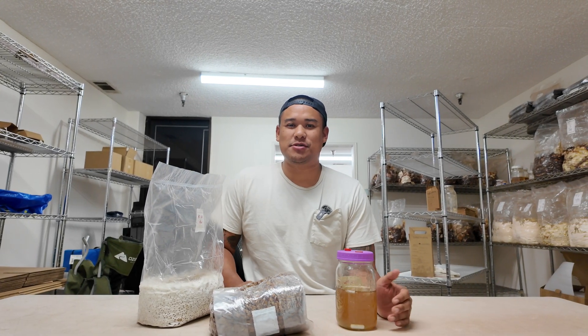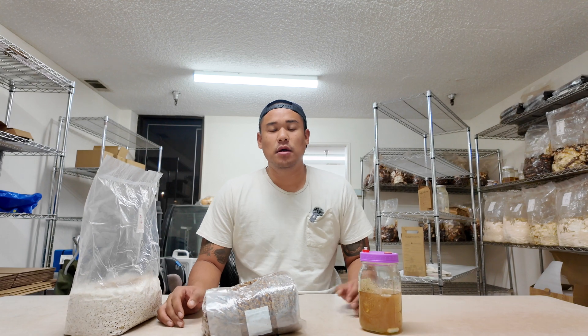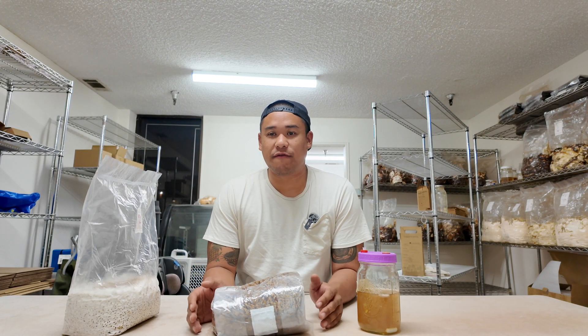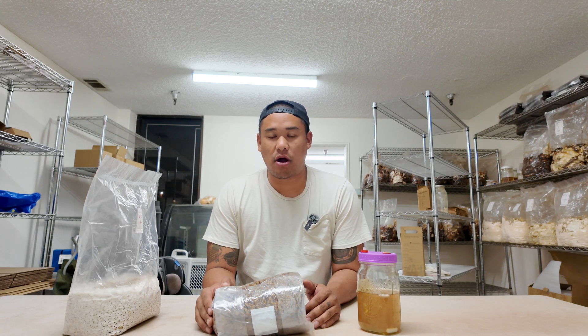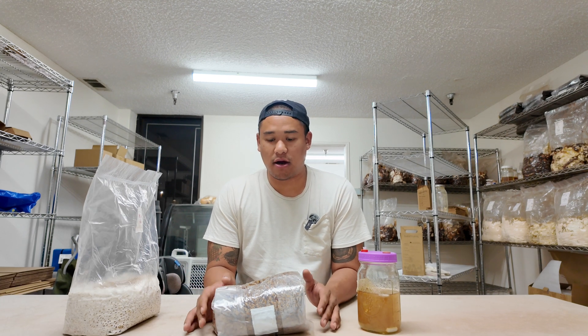Alright, what's up you guys, it's Justin from Long Beach Mushrooms. I want to show you what's next. In the previous video we showed you how we make grain spawn — we did our 24-hour soak, we bagged it, we sterilized it on our autoclave, and then we let them cool in front of our flow hood. So now we're at the stage where we need to inoculate our grain.